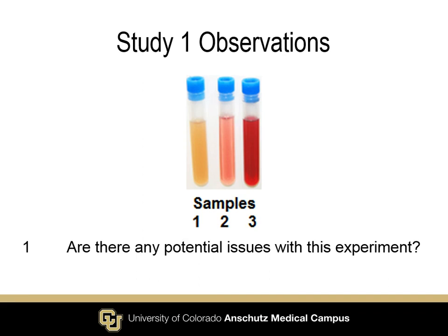Differences in the headspace and the tubes between them. The headspace, definitely. Anything else you can think of? Anyone? Of course, I'm looking directly back at you because you were the first one to answer. Hemolysis? Yes, hemolysis. So based on those 2 observations, can you salvage these samples? Is there anything you can do to continue the experiment?